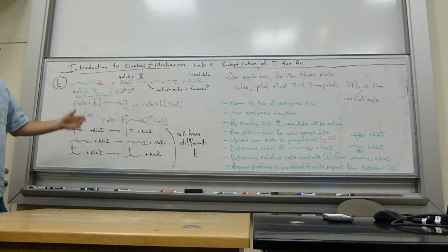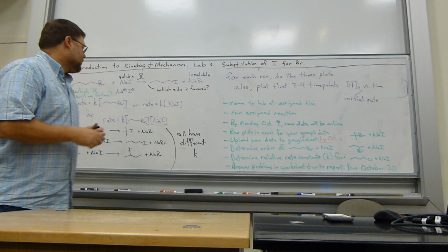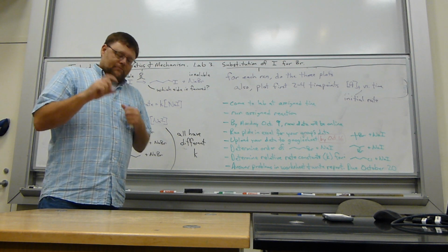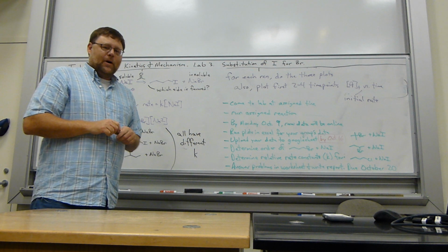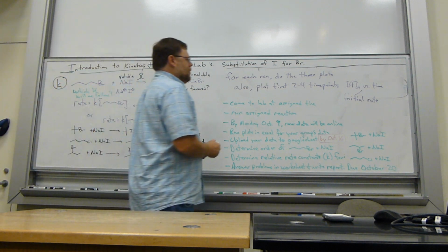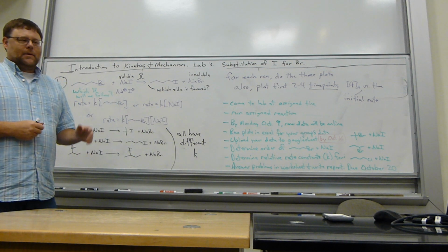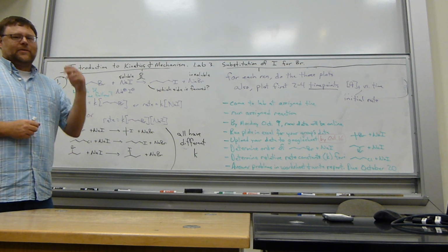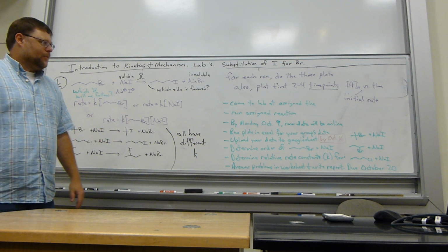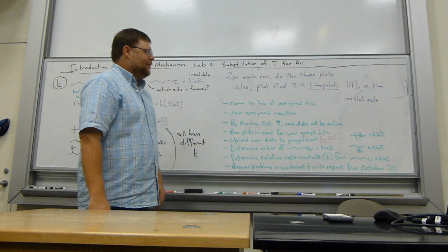That's why we're going to measure reaction rates using NMR. Like I said, you're going to come to lab and mix the reagents. We'll have stock solutions of all these things. You'll mix the reagents as described, shake them up, and quickly put the sample in the NMR machine. We'll run an NMR every minute. These are the time points; a time point is just when we run an NMR. We run an NMR, wait 60 seconds, run another NMR, wait 60 seconds, run another. After 10, 15 minutes, we'll run them every 2 minutes, and then go out to about 30 minutes to an hour. But you'll get 15 to 25 time points per reaction.